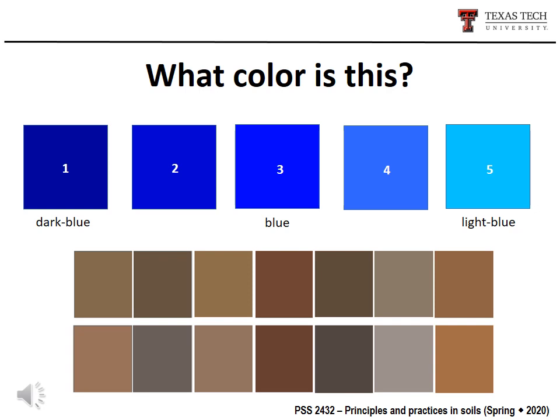Also, the perception of color is very, very particular. For this reason, there are some color systems to try to standardize the color measurement. And now let me show you some color systems. Okay, let's go.